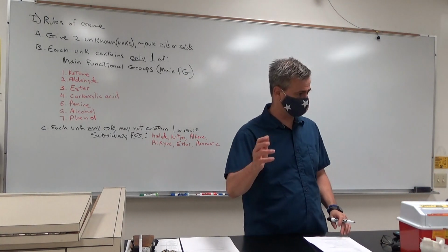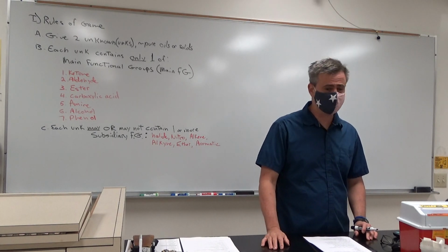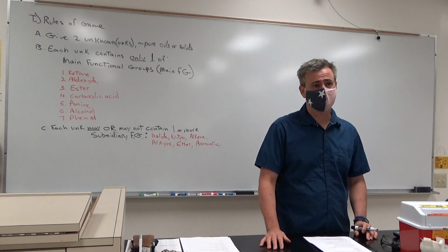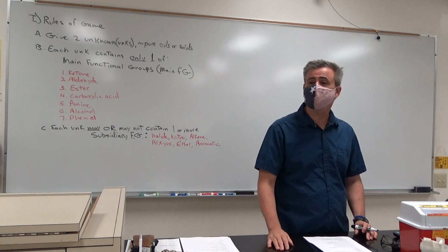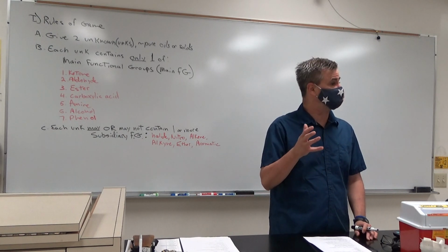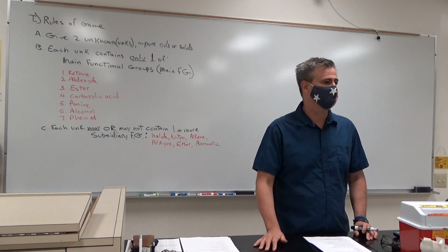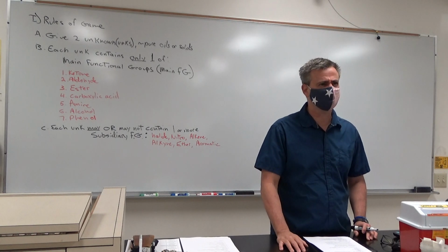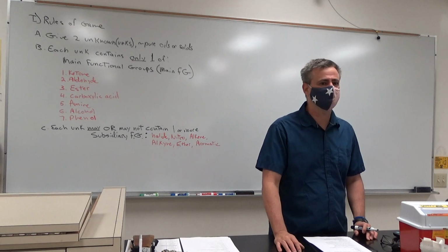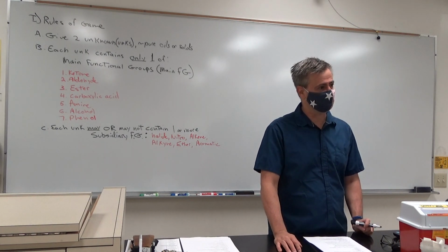All right, so the initial physical tests can sometimes give you a little bit of an idea of what functional group it might be. Amines have a pungent, fishy smell. Esters have a sweet smell. Alcohols also have a sweet smell, and so forth. Carboxylic acids often have a noxious smell. Body odor is partially butyric acid, which is a carboxylic acid.